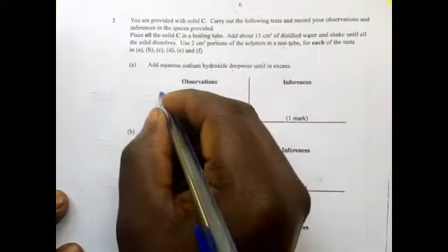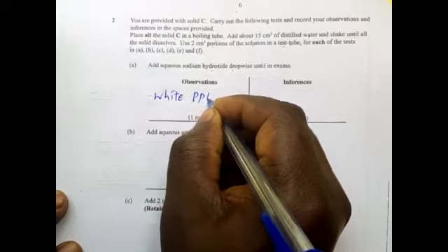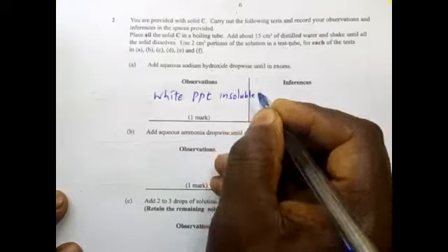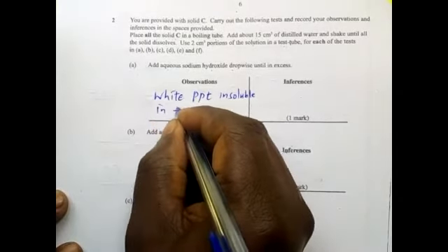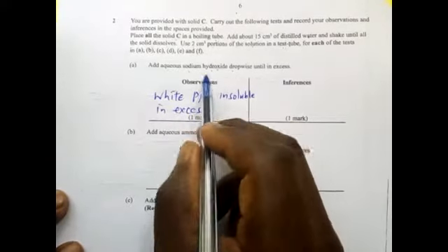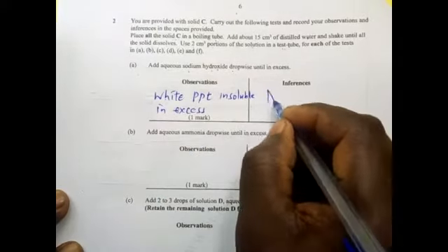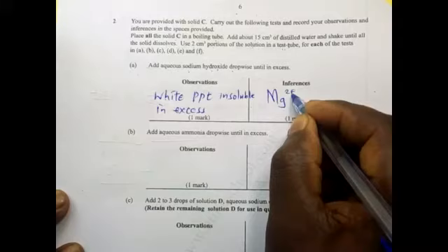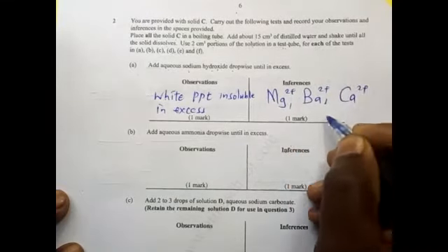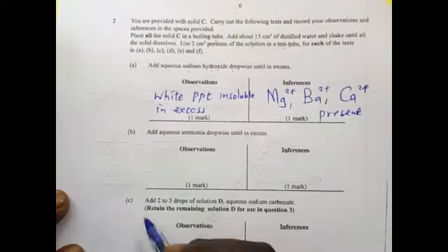Let me give you the observation that was there then. White PPT, insoluble. White PPT which does not dissolve in excess. I have always told you, once you are adding sodium hydroxide, a white precipitate is formed which does not dissolve in excess, then be sure magnesium ions, barium 2 ions, calcium 2 ions are present. That one you are sure of.